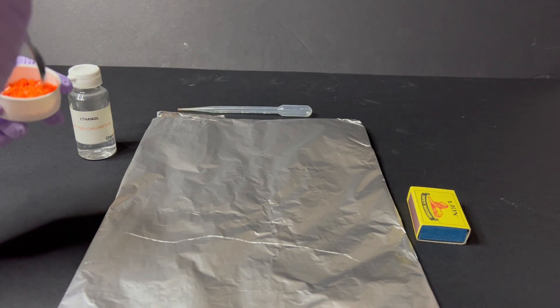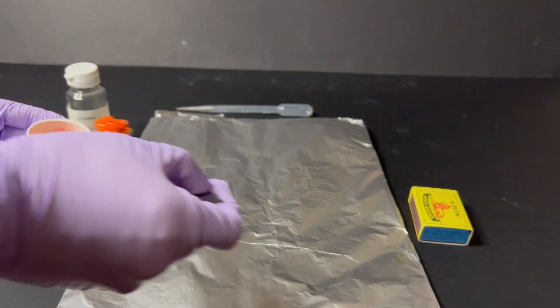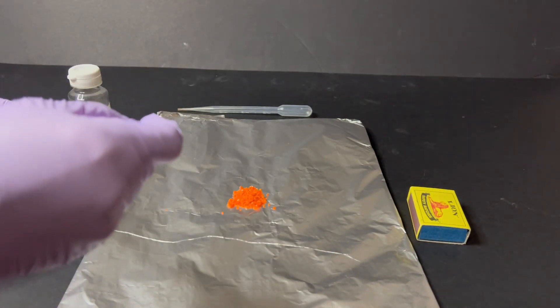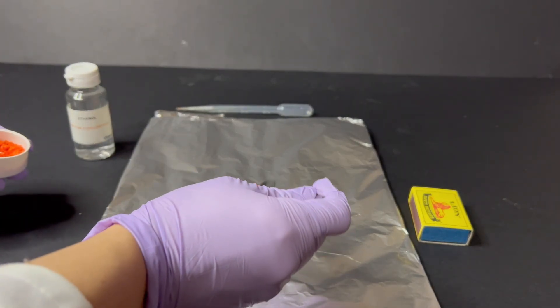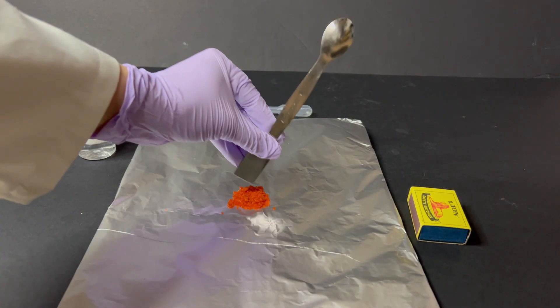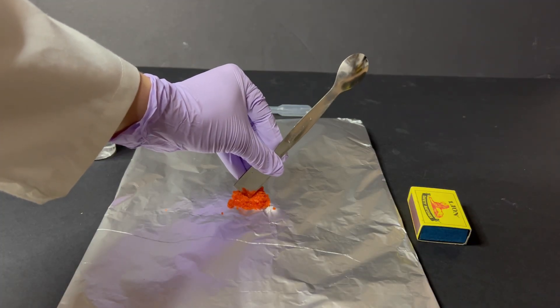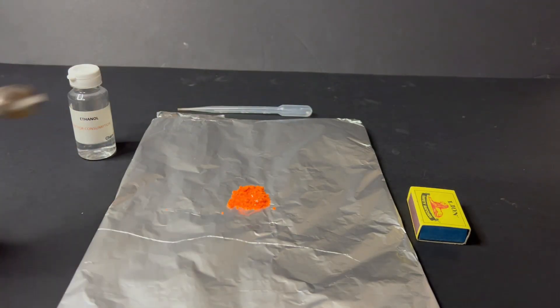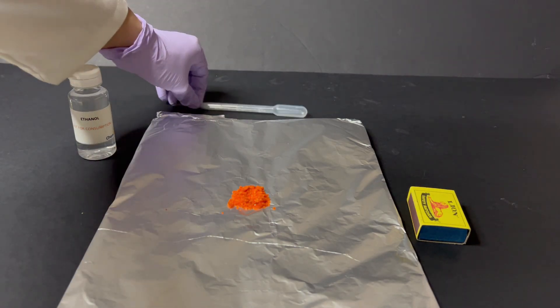I'm taking about two spatulas of the ammonium dichromate and placing them in the centre of a piece of aluminium foil. Next, I make a small hollow in the middle of the heap. This will be the spot where I'll add a few drops of ethanol to help ignite the reaction.